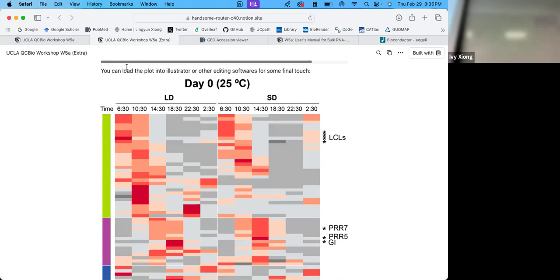Because this one, yeah, you can finish the remaining from this one. That's nice. Yeah. Okay, so find that. The gene names, but I'm not there yet. So now you can proceed to clustering. Yes.